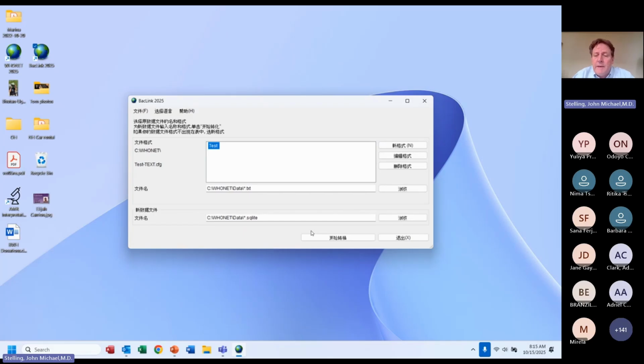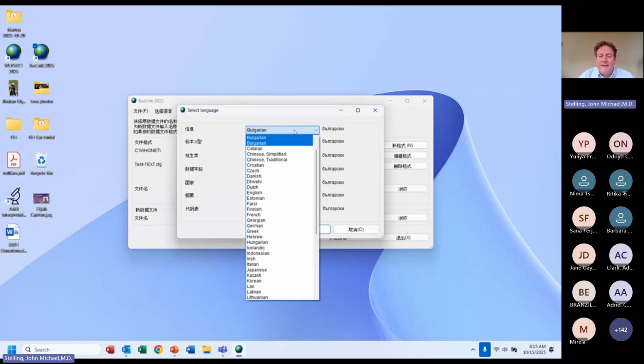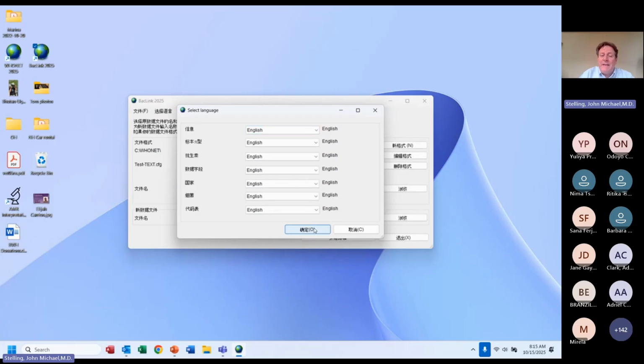We have used Google Translate and Amazon Web Services translation. These are very good, but they're not perfect. So if you see a translation that's incorrect, please help us out and tell us, and then we can fix it. I'm going to show you something a bit funny.